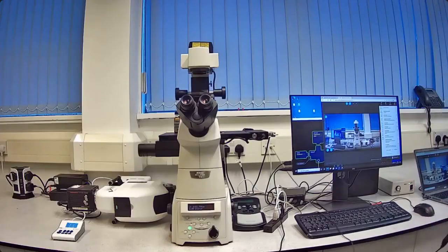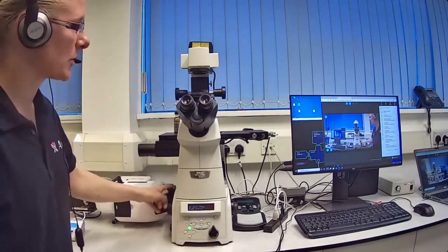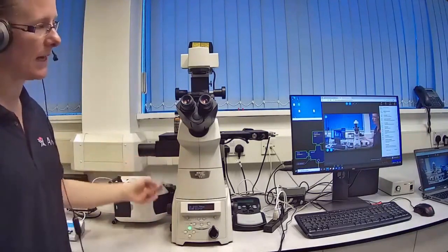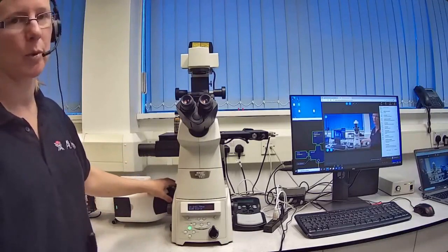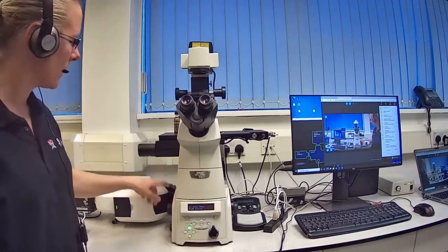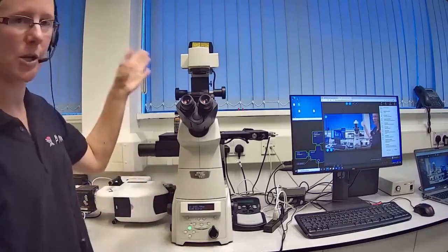Here is our demo room setup. We have our Clarity laser-free confocal system attached to a Nikon TiE microscope. The system fits onto any C-mount camera port on your microscope — whether on an inverted microscope like this one or on an upright as shown in the presentation.